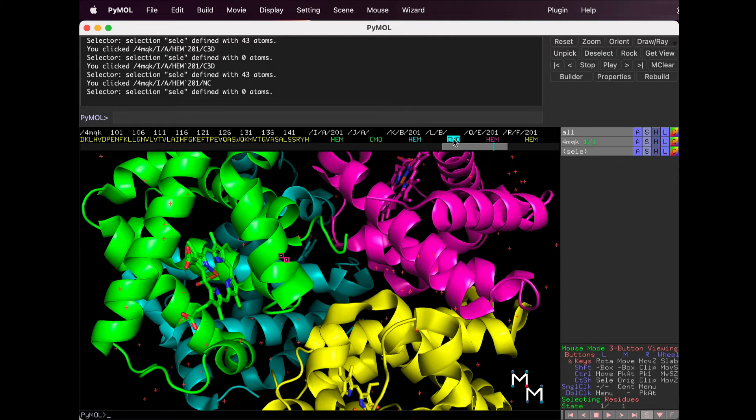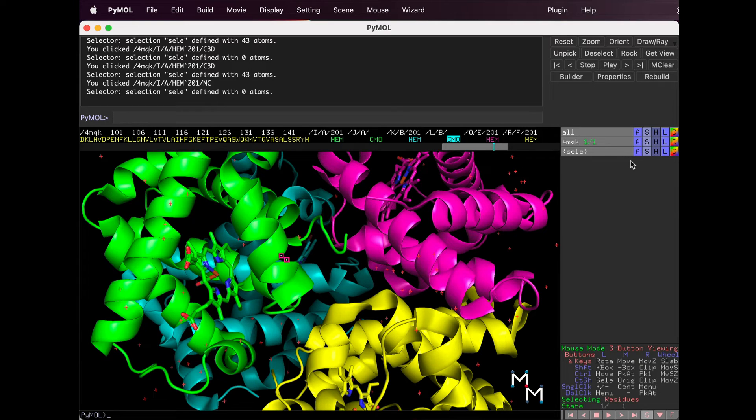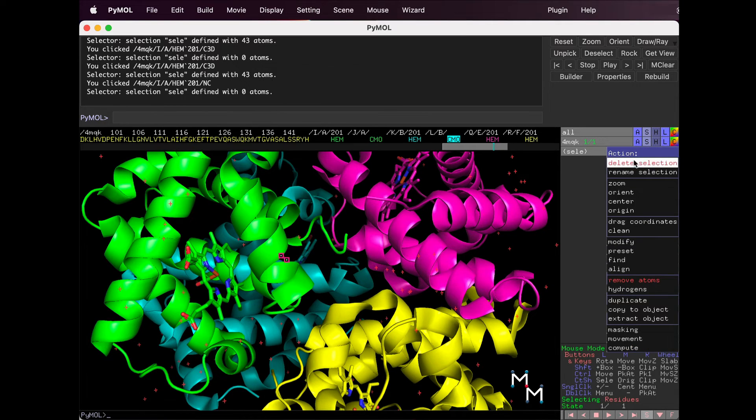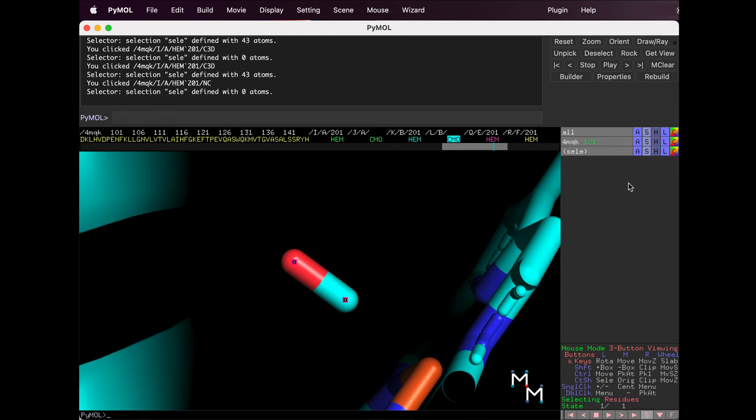The letters S-E-L-E pop up in the names panel here, and this selection corresponds to whatever we have selected. Click the A button for Actions and choose Zoom. It zooms in really close. I'll zoom out just a bit.